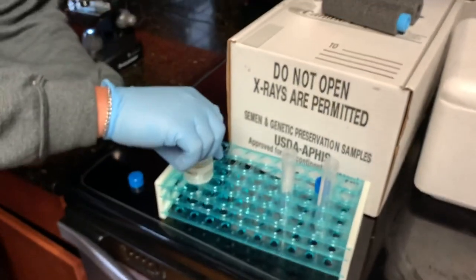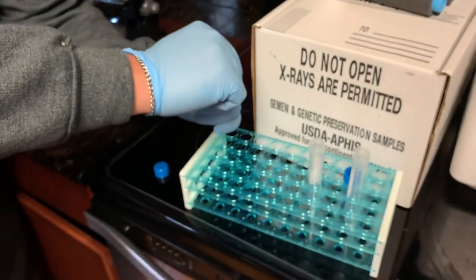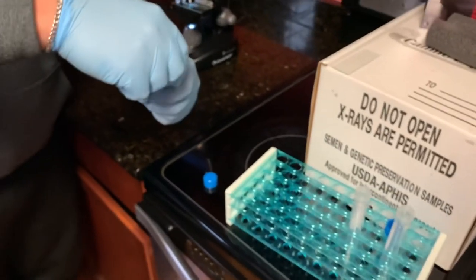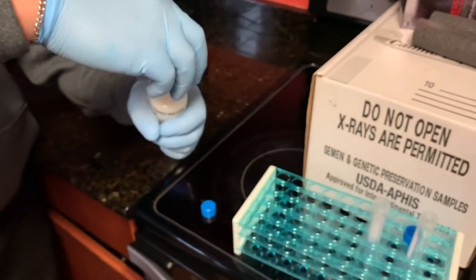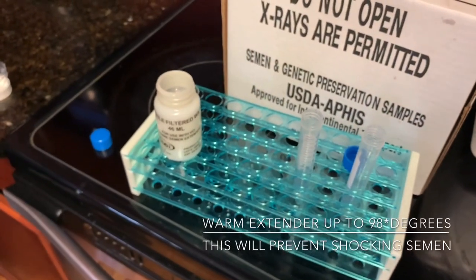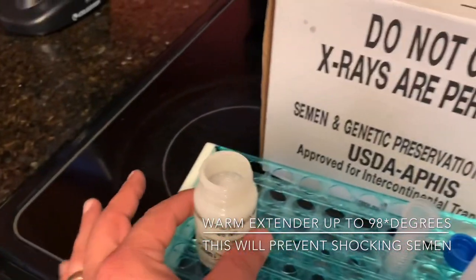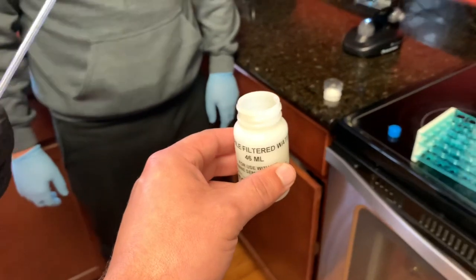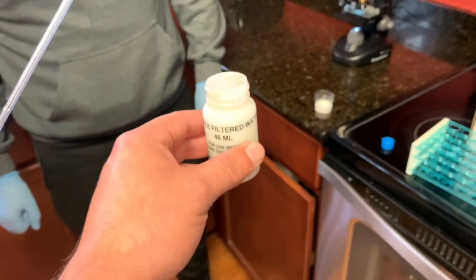The sterile filter, water. This is the extender. Actually, shake it up one time for me. Okay, you're gonna shake it. We're gonna open it. It's 98 degrees right now. So Justin will pull 8 cc's. So he's at the 2 cc mark, and he's gonna get it to the 10 cc mark. Go ahead, slide that in there.